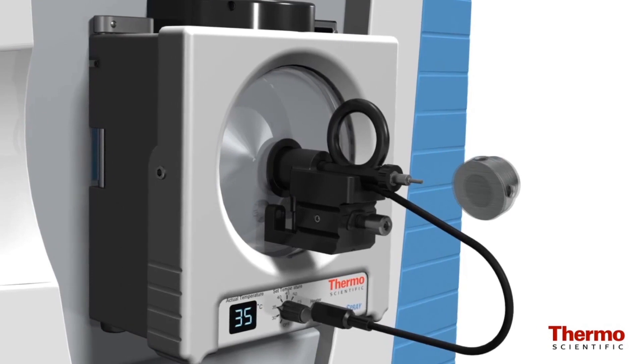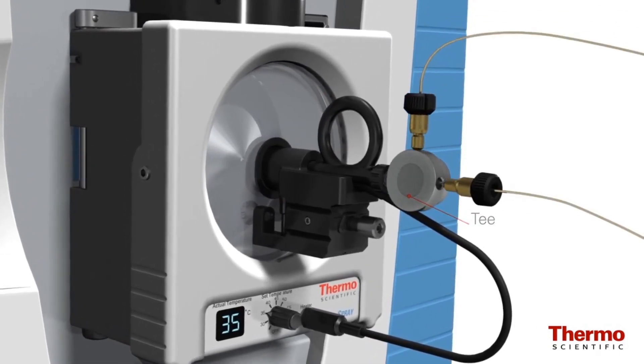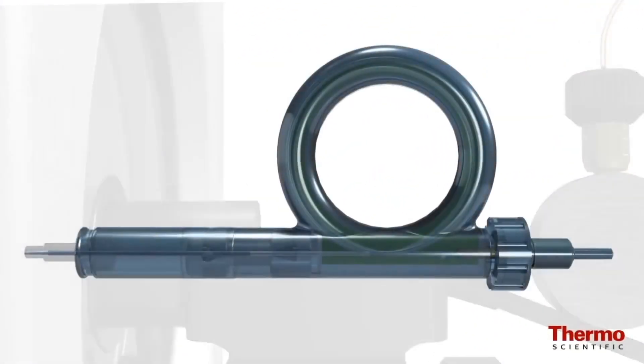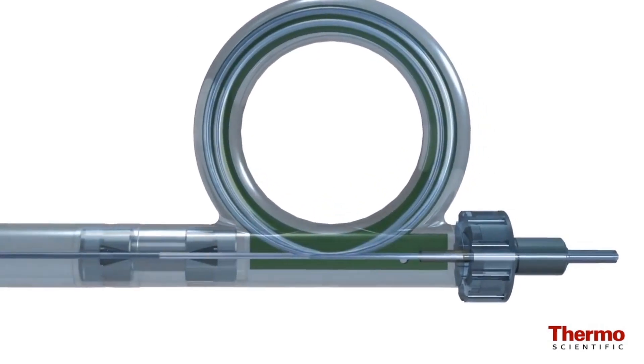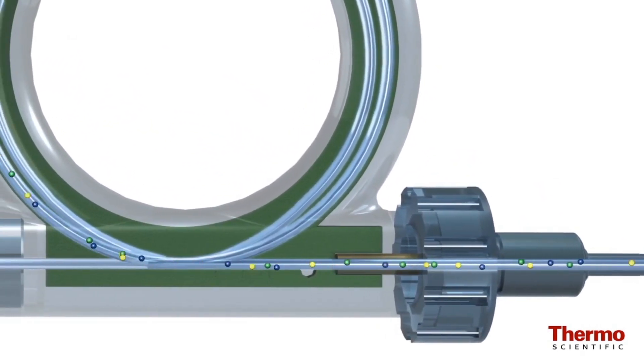The columns feature Nano Viper finger-tight connections that eliminate the assembly of peak sleeve connections and are capable of withstanding pressures up to 1000 bar. Spray optimization is straightforward with a simple adjustment knob to position the column within the source.